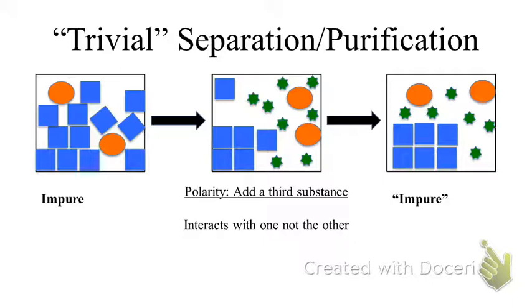Taken a little bit further, if I try to add water, let's say I've got sand and salt in these crystals here. The blue will be our sand, the salt will be the orange sphere. How does water get in and remove that sphere? The sphere is our salt.